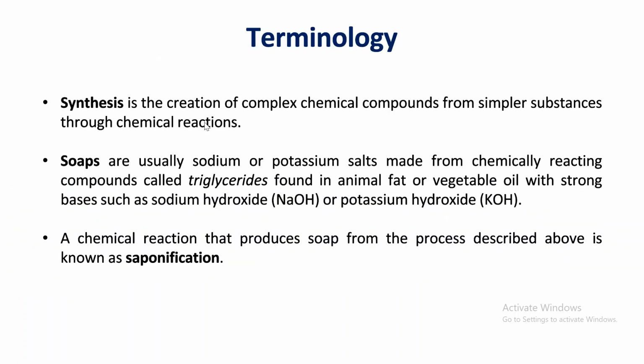So there is some important terminology that you need to know for today's experiment. Again, if you go back to the lab report template, you want to fill in the definitions that we are going to give you right now. So again, pause the video. We're going to go over the definitions, or you can write the definitions as I am saying them right now on your lab report template. So the first one is synthesis.